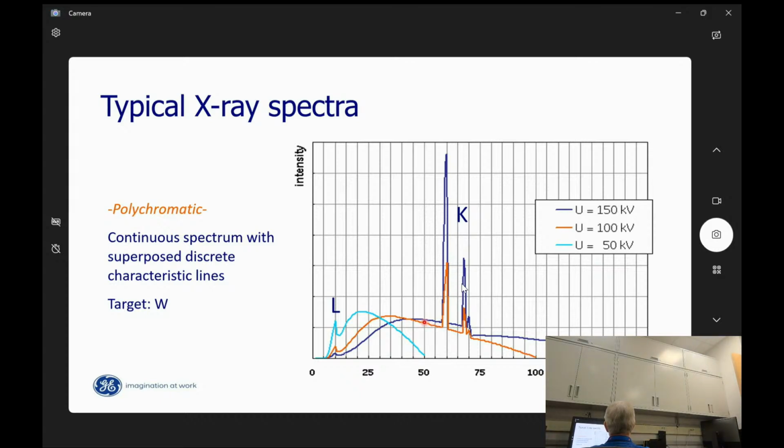I might get a little bit better contrast going to 50 kV, but I'm not going to get nearly as good of count rate. And in many situations that we deal with, soft samples, biological samples, doubling a scan time allows the sample to shrink or sag, and now I'm getting useless results even if I get slightly better contrast.